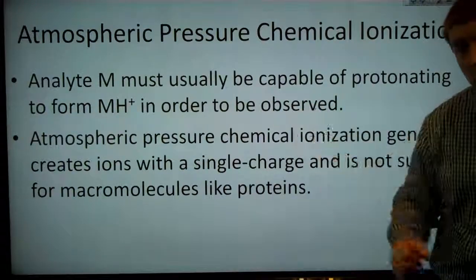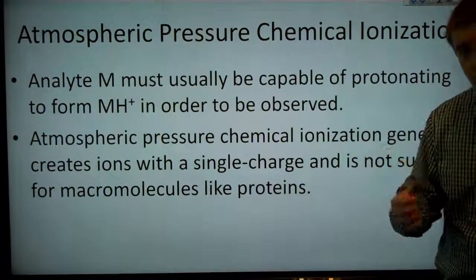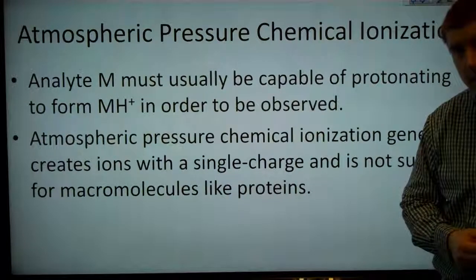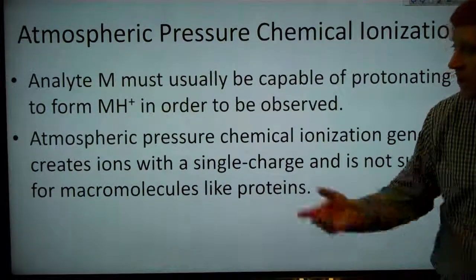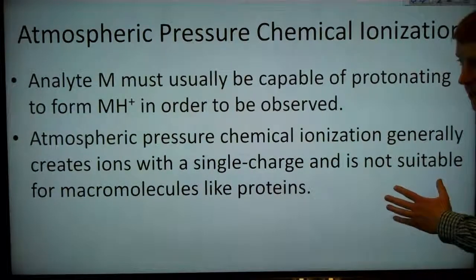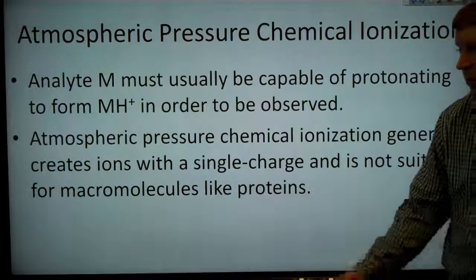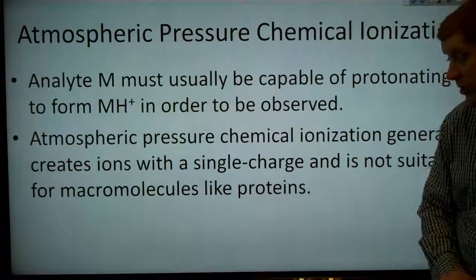An analyte M must usually be capable of protonating to form MH+ in order to be observed, because if it doesn't protonate, then it may not form any ions at all, and if it doesn't form any ions, then we can't detect it in mass spectrometry. So atmospheric pressure chemical ionization generally creates ions with a single charge and is not suitable for macromolecules like proteins.